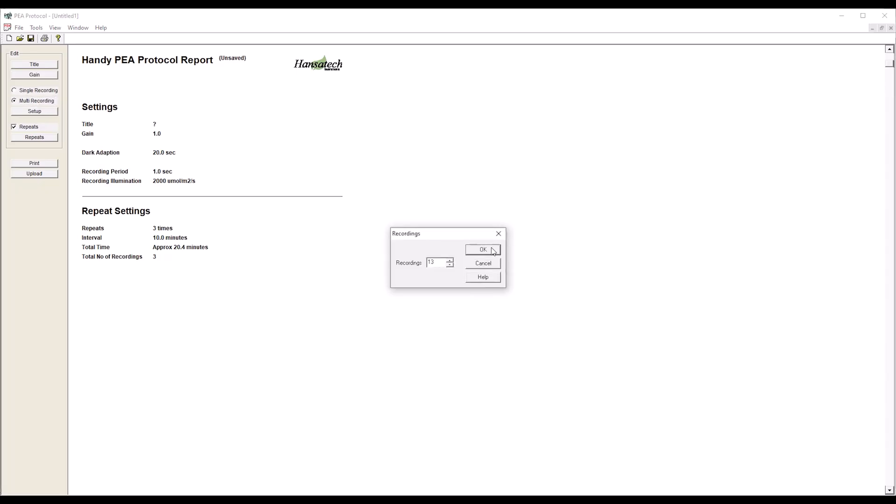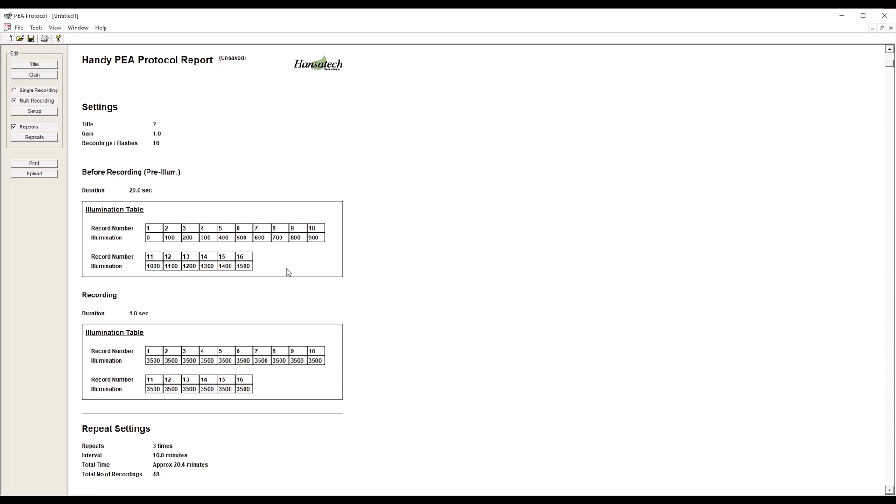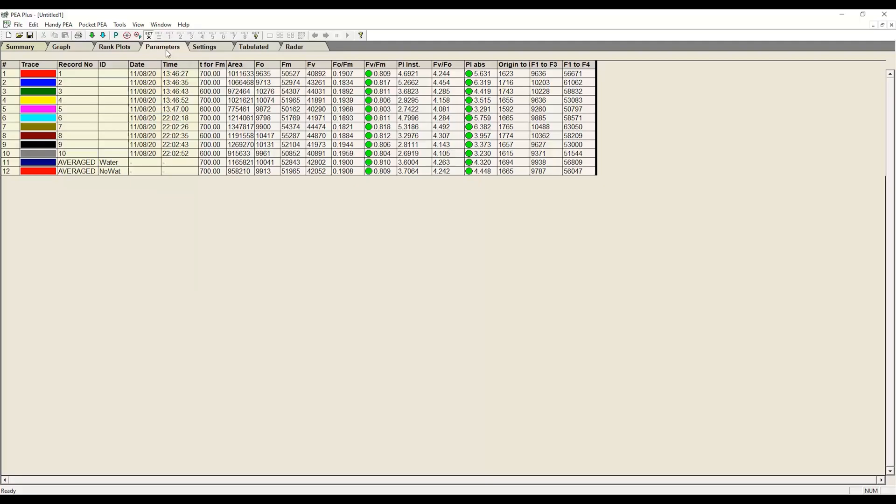Complex protocols are easy to define in a bespoke PC-based editor, although Handy P Plus can also be configured directly from its keypad. Data is quickly transferred to a PC via a USB connection, to be explored further with the supplied software, P Plus.